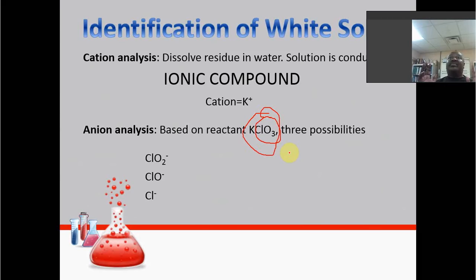There's oxygen coming out, and this is the only location for oxygen, so some of that goes out. So maybe I'll speculate that the counter ion to potassium is this one, going from 3 to 2, or the chloride ion?